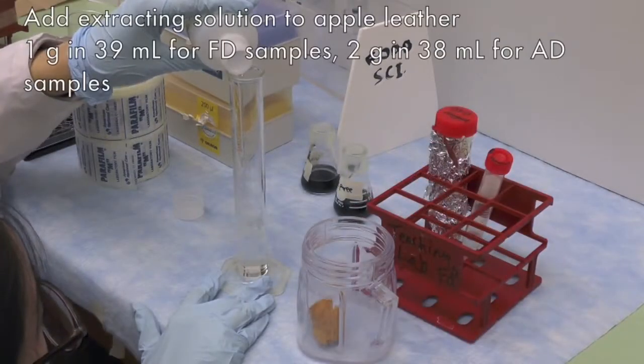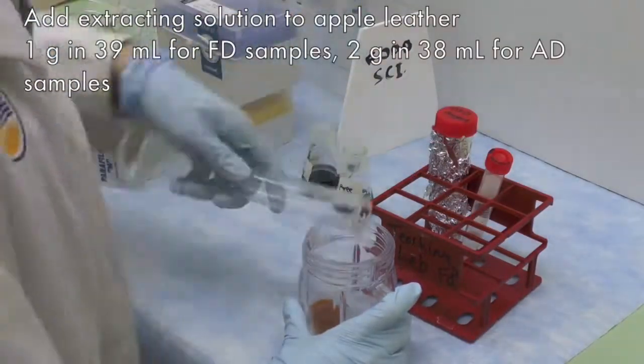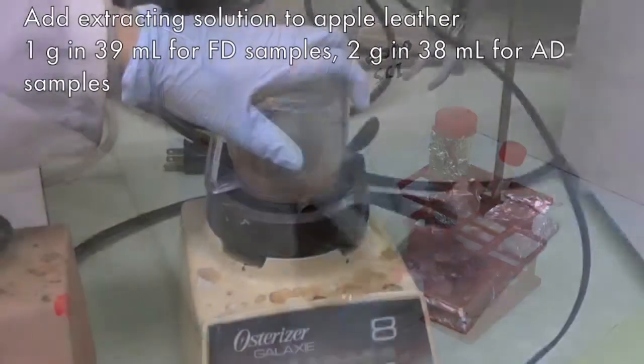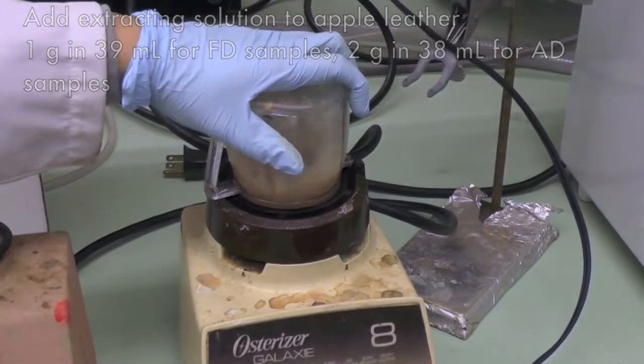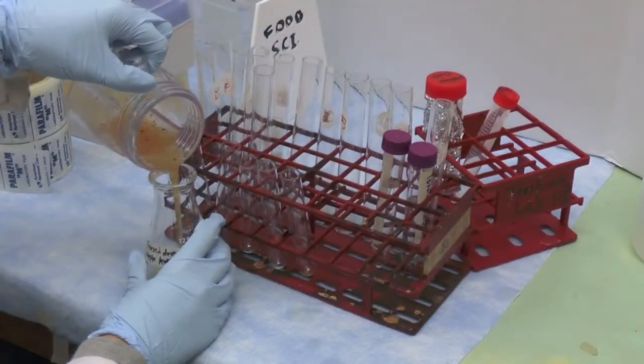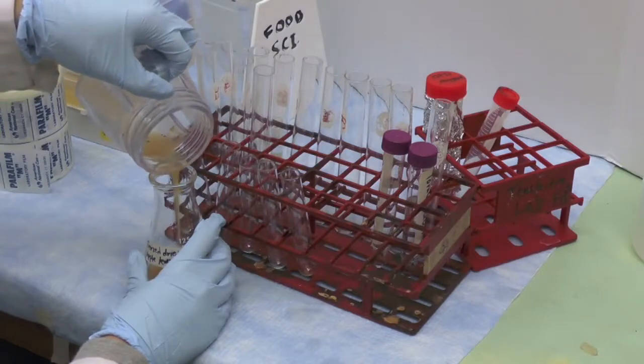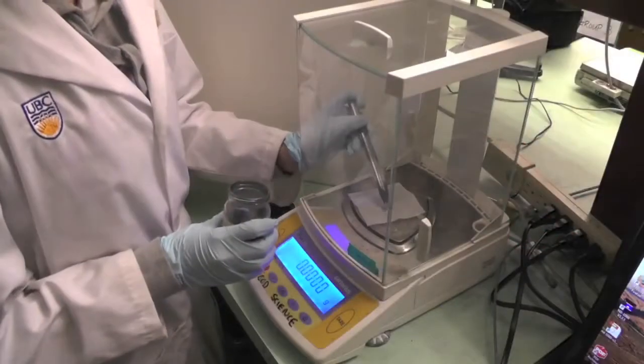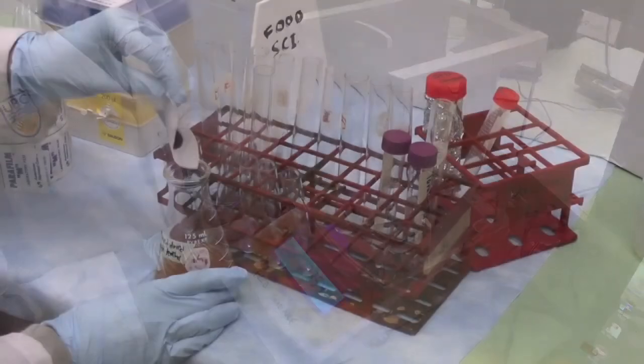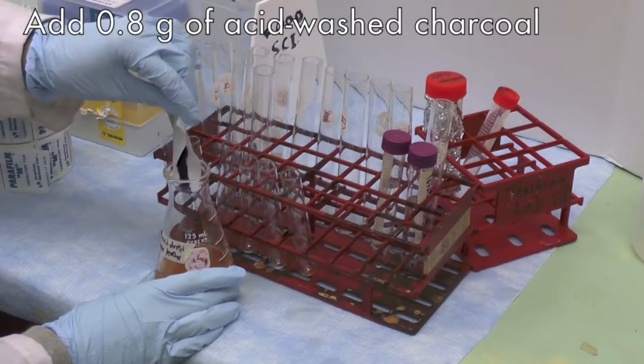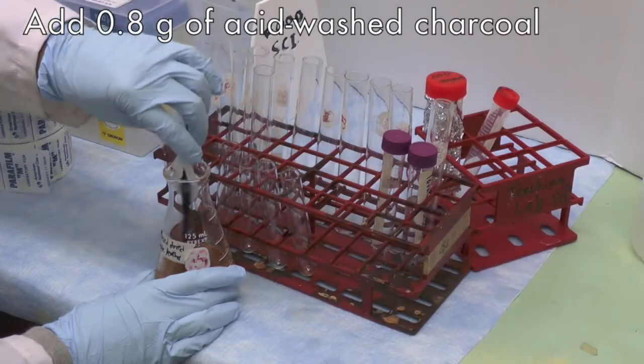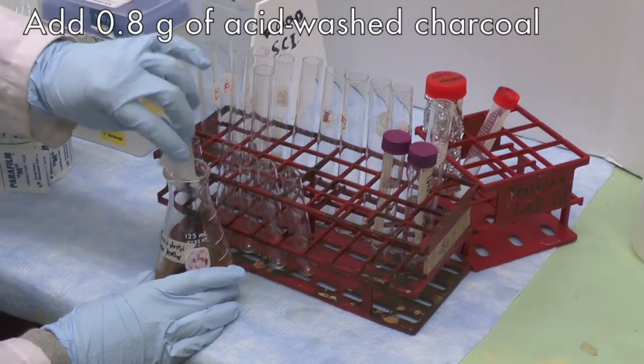For fruit-leather sample, blend the appropriate amount of apple leather and extracting solution into a slurry. Transfer the slurry into a 125 ml Erlenmeyer flask. Weigh 0.8 gram of acid-washed charcoal and transfer to the 125 ml Erlenmeyer flask containing the fruit leather slurry.